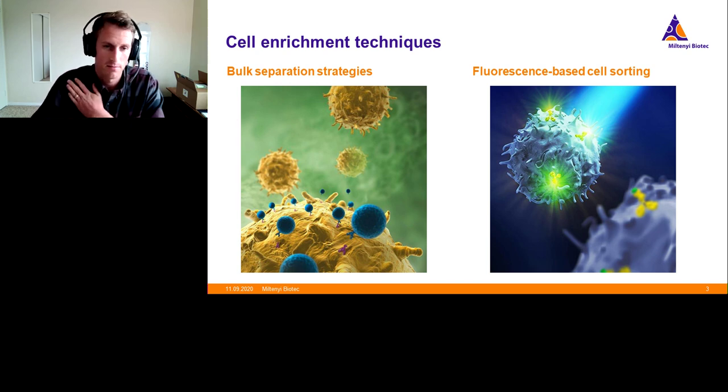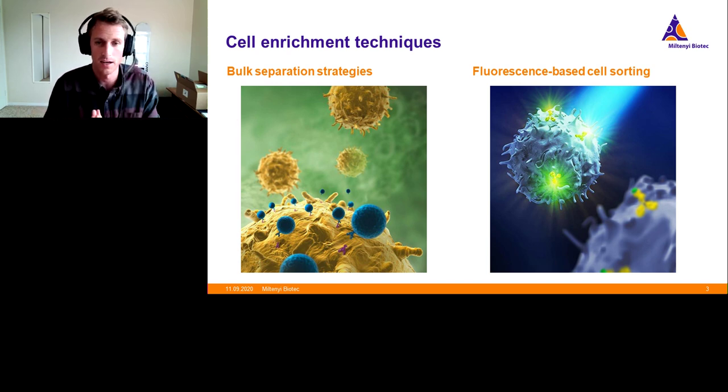This technique of magnetic enrichment has the advantage of being able to be done in a closed system, which has obvious implications for cellular therapy and sterility. But in the context of today, it has particular benefit in that it contains the material and allows an operator to feel a lot more comfortable working with technology like that.